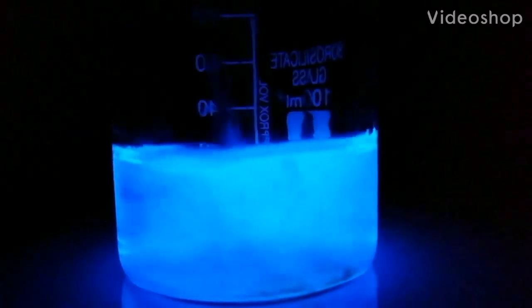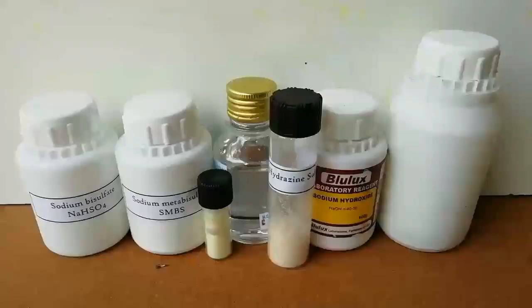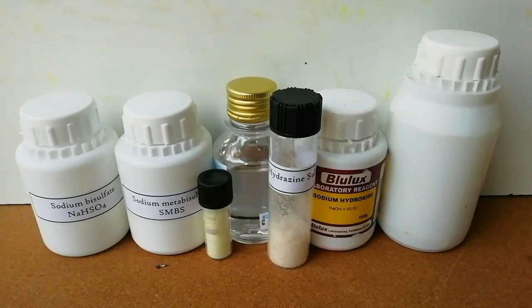In this video we are going to make luminol using 3-nitrophthalic acid, hydrazine sulfate, and sodium acetate dihydrate. In previous videos I showed you how to make hydrazine sulfate and 3-nitrophthalic acid. Here we are going to convert it to luminol.